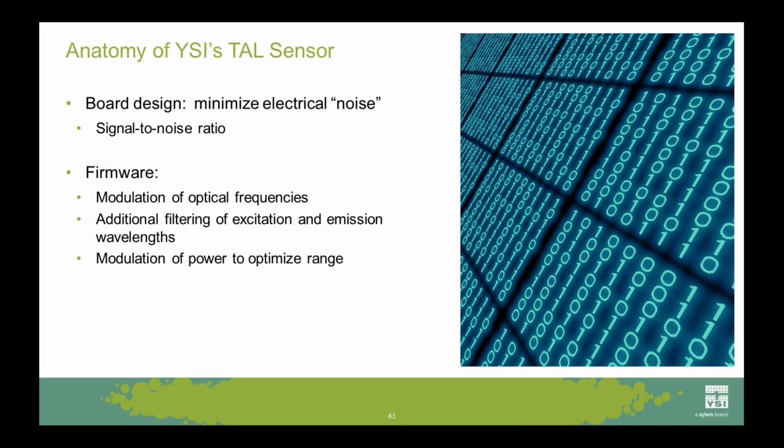It also aids in what I refer to as electrical filtering. Stray light does reach the photodetector. I'm often asked if ambient light interferes with these optical sensors. It doesn't, and in part that's because of the firmware. So the sensor knows the light that is coming from only the stuff you care about. It knows that also via timing, in a manner of speaking.